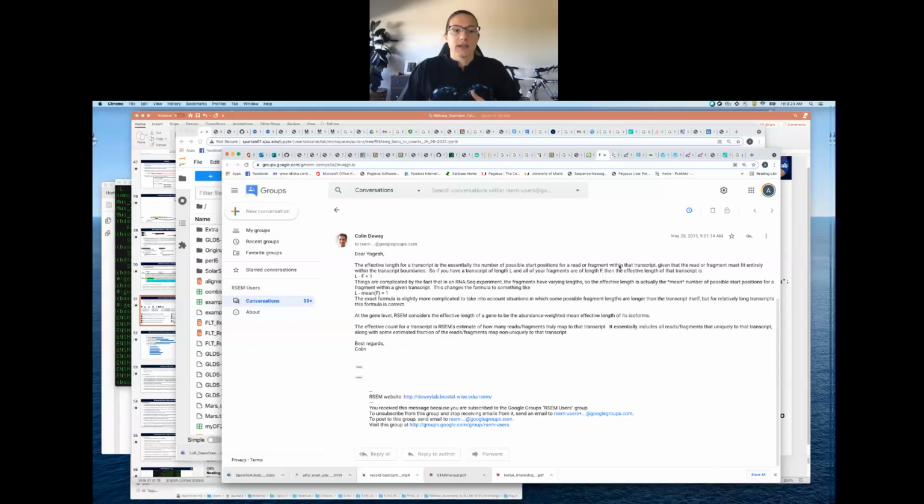So you have to make sure that the fragments you chopped up, covering from start to end of a copy of each of those transcripts, don't go over the transcript length. It has to fit within that, and that's why it's based on how long those fragments are. You can't have a portion of a fragment; you have a full fragment aligning.